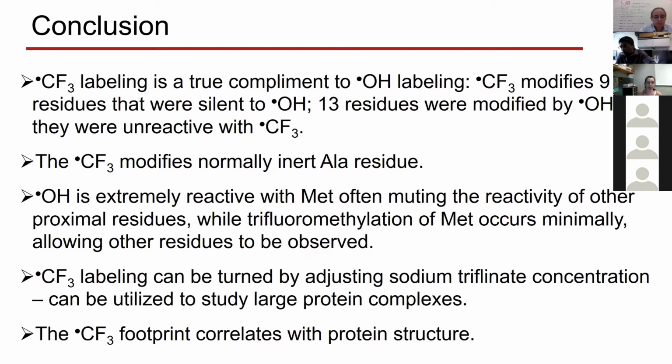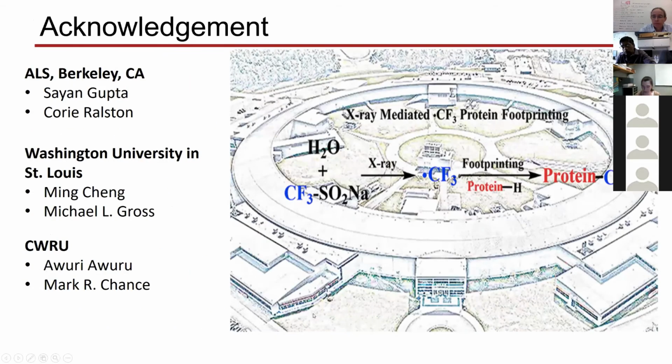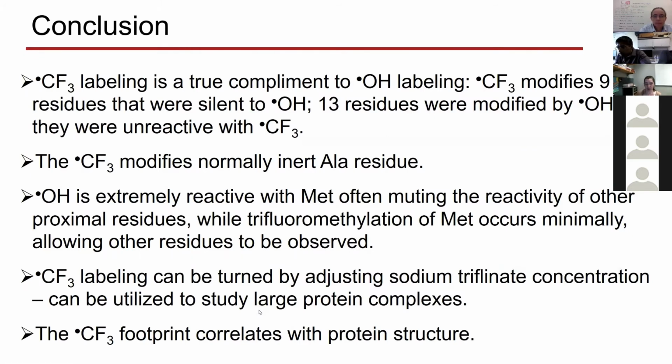And lastly, the CF3 footprinting experiment nicely correlates with the structure. We're still trying to assess if we can actually quantify solvent accessibility like we do with hydroxyl radicals. We're not at that stage yet because we're trying to determine reactivity.